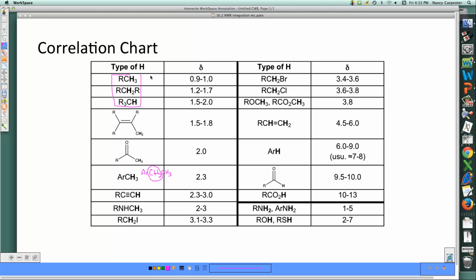Well, I see that a methylene appears, let's say roughly about 0.4 parts per million further downfield than the methyl. So I would expect this guy probably is going to show up around 2.7 or so. So that trend is consistent throughout the entire structure.